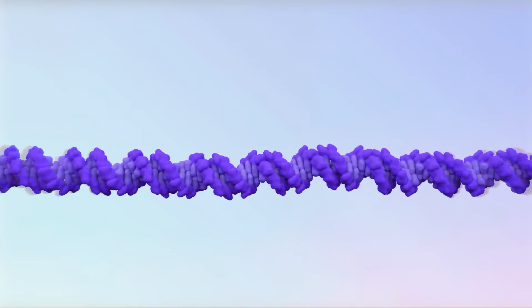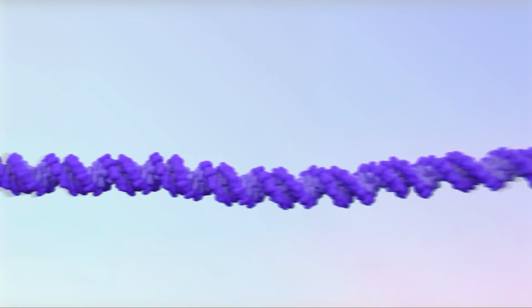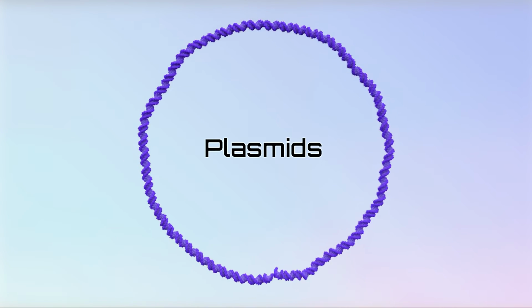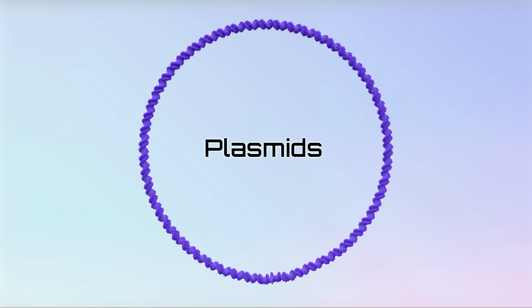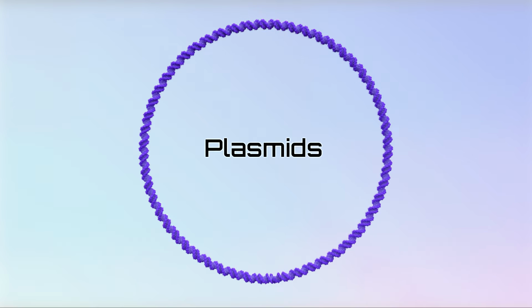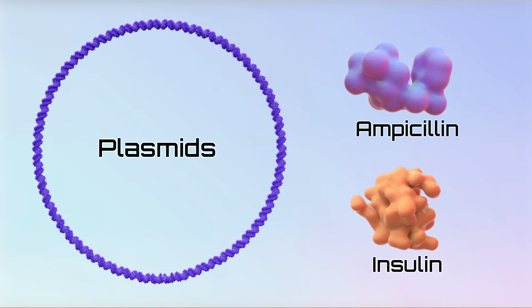In this video, we'll review the transformation process used to insert plasmids into the E. coli bacteria you'll be using in this project. As you know, plasmids are circular pieces of DNA used to drive the production of specific proteins. These plasmids include promoters, operators, and associated elements like genes that encode for specific antibiotic resistance proteins and the target protein. In our project, the antibiotic resistance gene will be for ampicillin, and the target protein will be insulin.